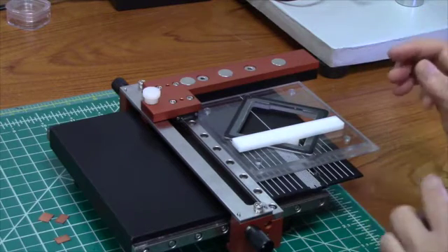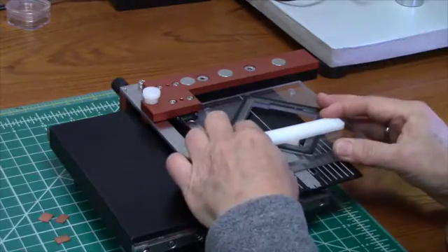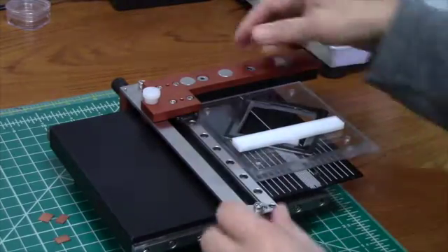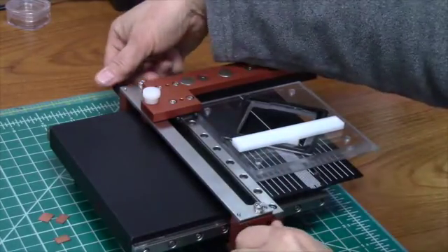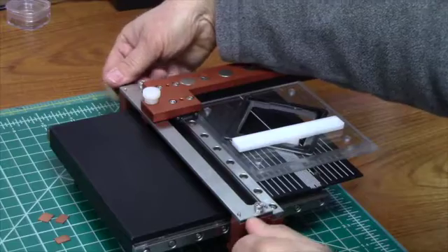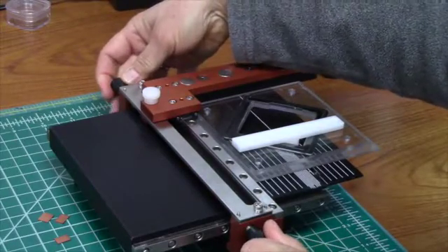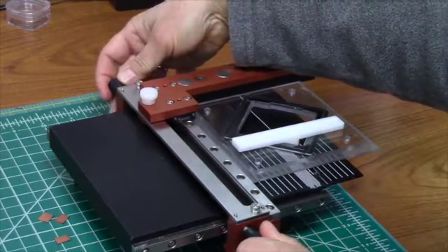Now that the sample is held, I can slide it over the diamond scribe.